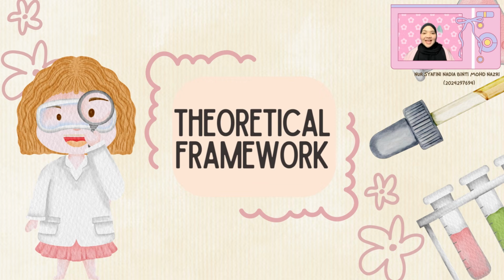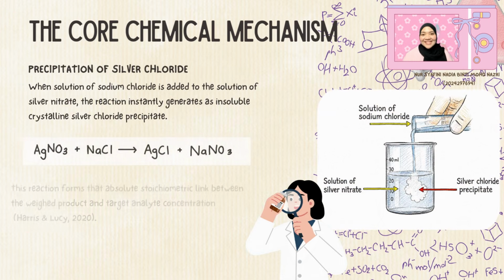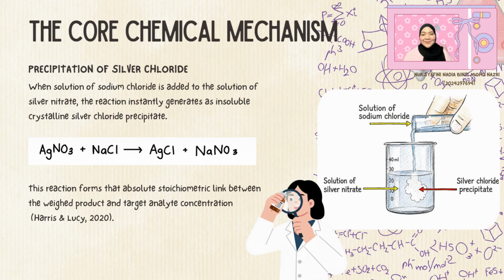For the next part, let's look at the theoretical framework. Let's dive into the core chemical mechanism behind our analysis, which relies on the precipitation of silver chloride.